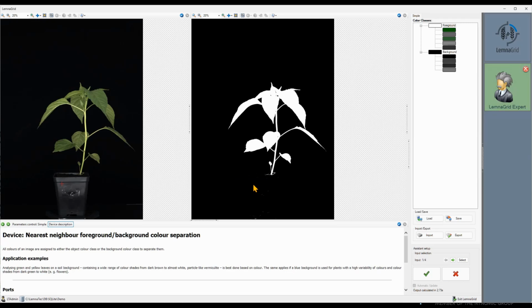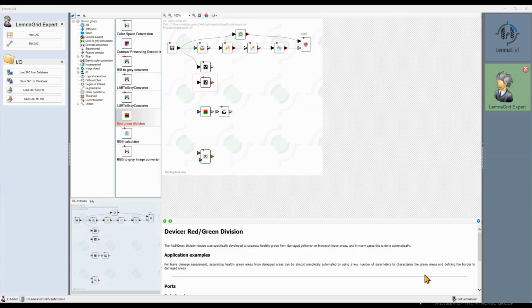If you remember, the distances between colors are not that well correlated with the human perception. This device is easy to use and understand, but it has its flaws in terms of handling more complex images and speed. It is also harder to write its parameters into publications. A similar device is a foreground-background color separation with distance threshold. It has a similar icon as well.